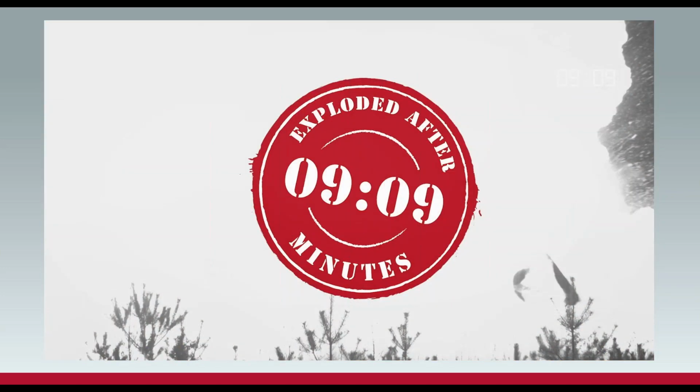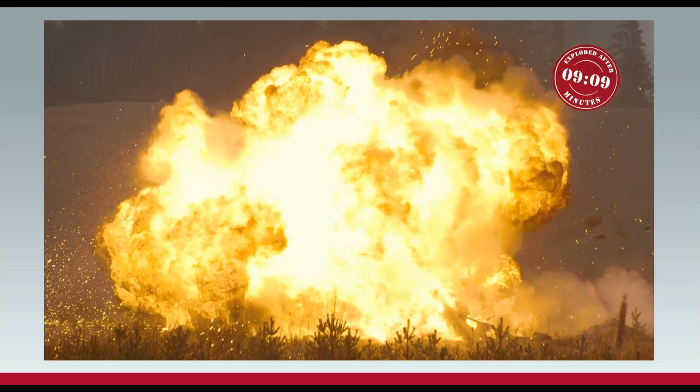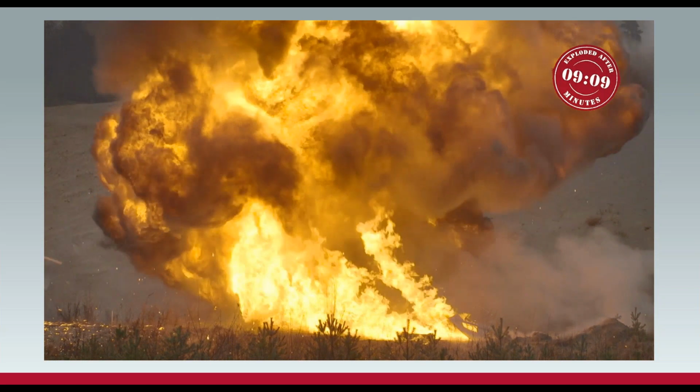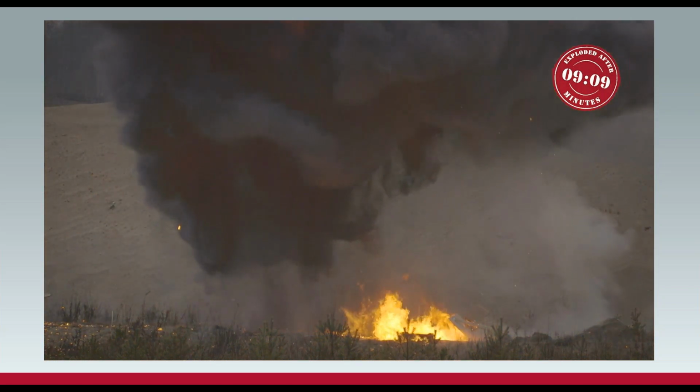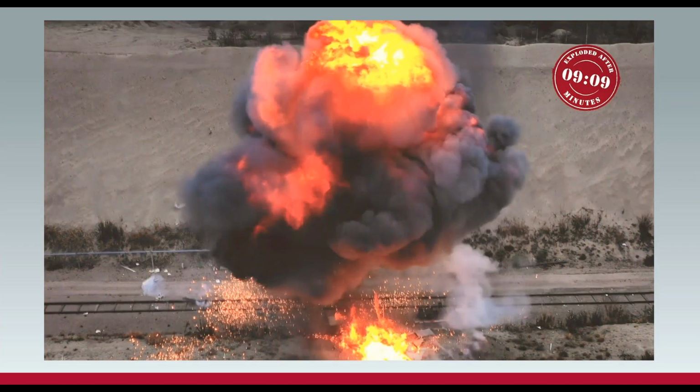Now, huge explosion. That's an acetylene tank. There it goes out of the bottom right after 9 minutes, and that's the oxygen tank. So that explosion itself is completely just acetylene. And then we create that flying projectile of a very forceful oxygen tank flying out of the way.